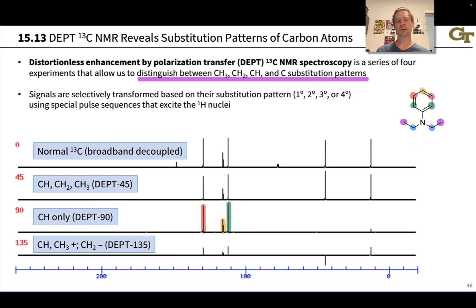Now that we know the CHs, we can infer the CH3s from the 135-degree spectrum and the CH2s from the same spectrum which will go negative. Here we have a negative signal that corresponds to a CH2, and there's only one type of CH2 in the molecule, these methylene groups, so those must correspond to this signal. Note that it is deshielded, downfield relative to the purple signal which corresponds to the CH3.